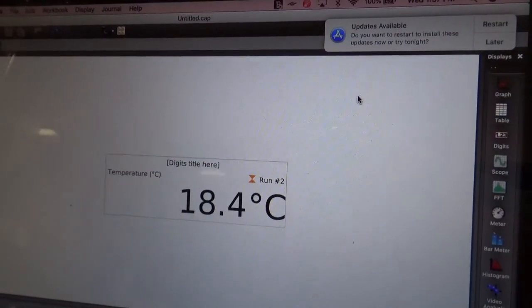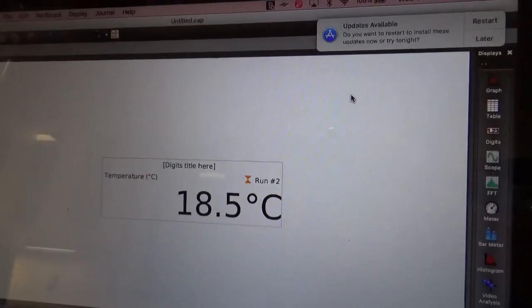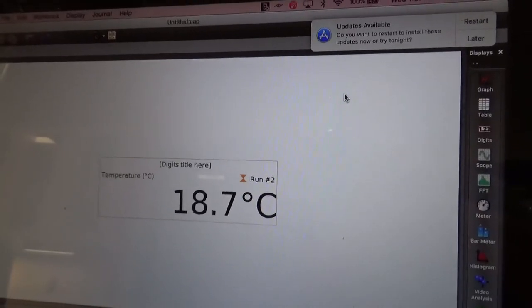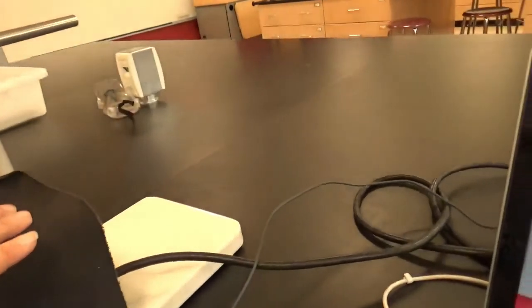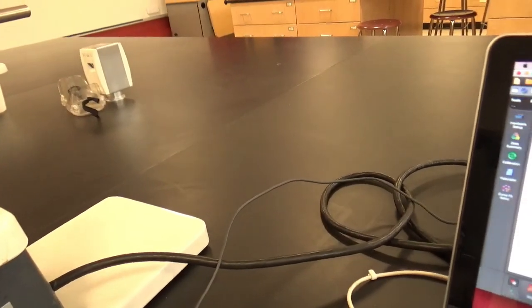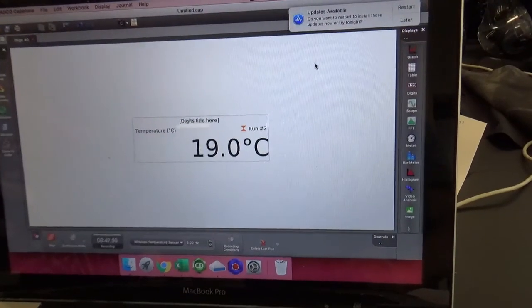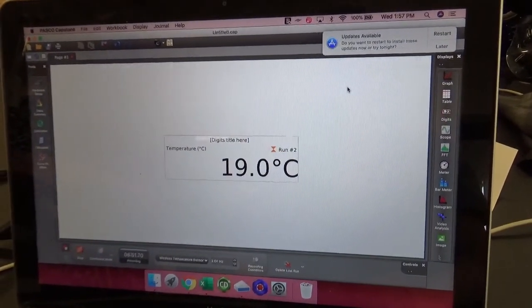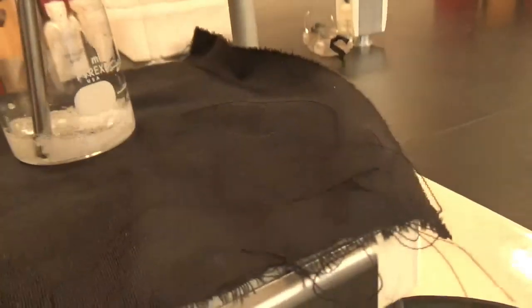Actually, I'm going to put some black paper or black cloth so we can see how the dissolving is going. Unfortunately, I got to raise this up a little. That's going up quite fast, but that's because I took it out for a minute. Oh, you see, now you can really see how cloudy it is. Oh, that's really good.